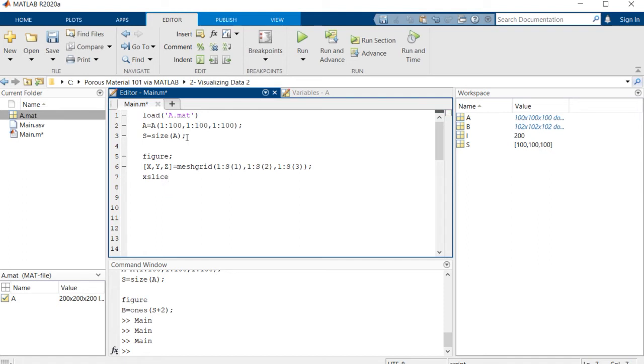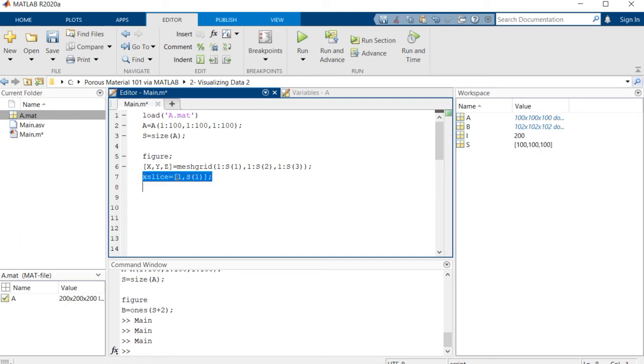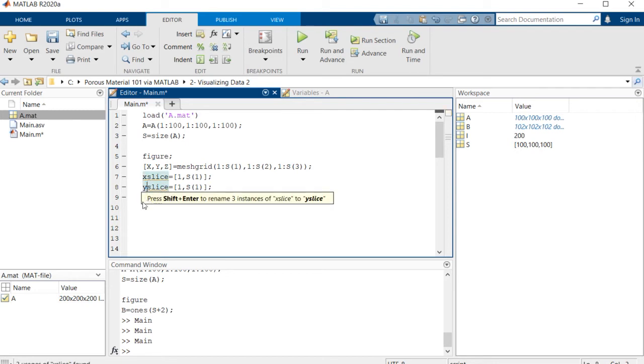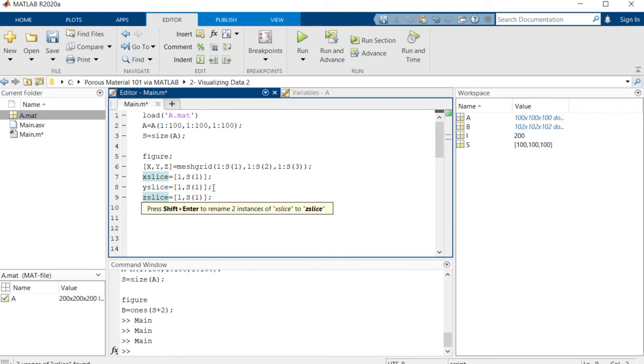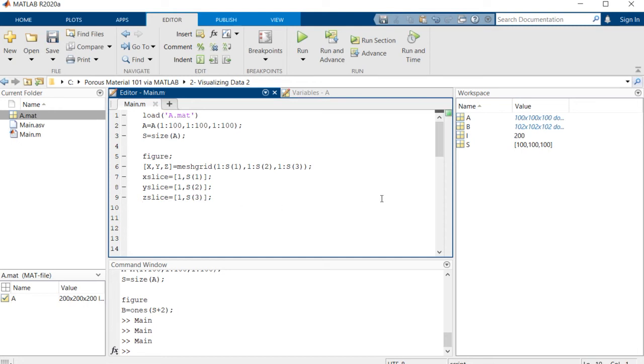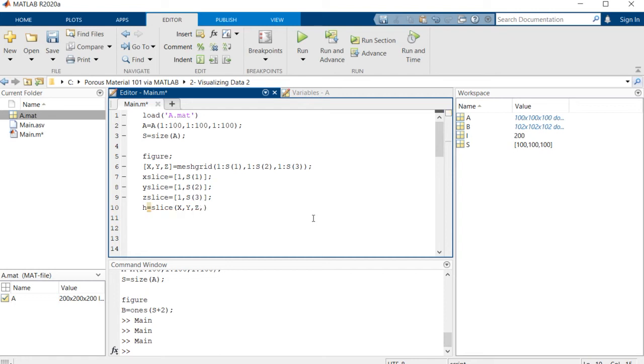And then we want some slices to be visualized for us. For the x dimension we want the first and end slices, and let me copy and paste this command and change it to y and then z and then the second and third element of s. At the next step we're going to use this command in MATLAB is slice. We say this is the mesh that we had, and then this is the matrix which you need to read the values from that matrix, and then these are the slices that we have: x slice, y, and z.